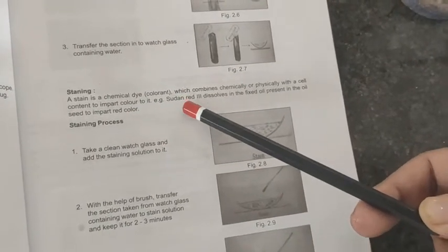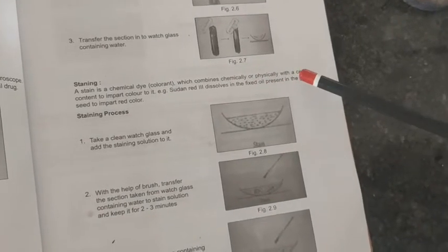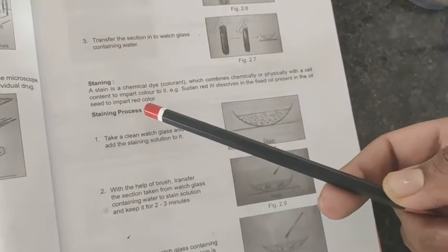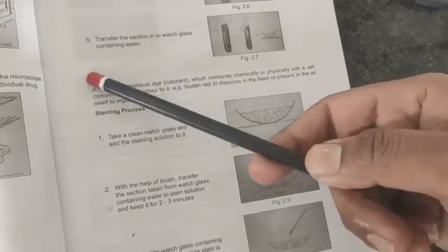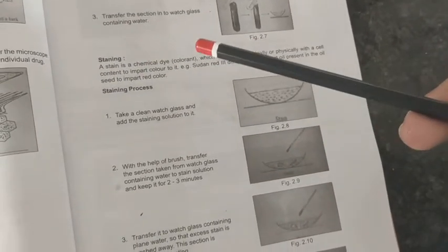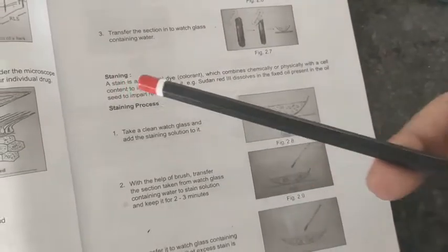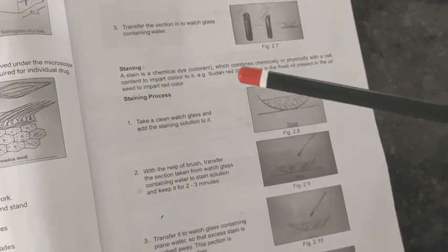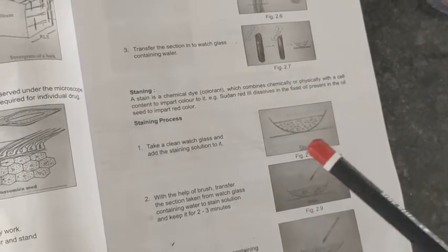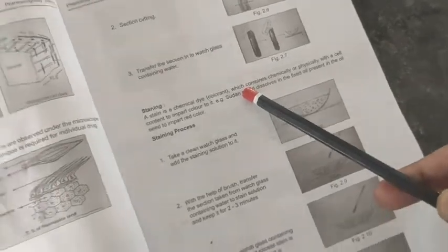For example, Sudan red dissolves in the fixed oil present in the oil seeds to impart red color. Stain means a dye which combines physically or chemically with a cell. All of you know white dresses which are colored by the laundry. This is the same, this is your dye or colorant.